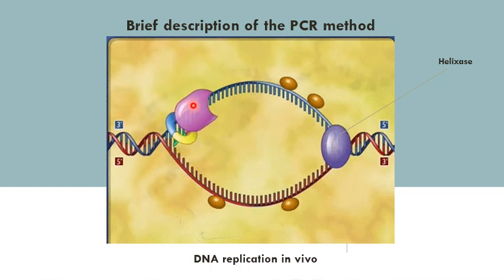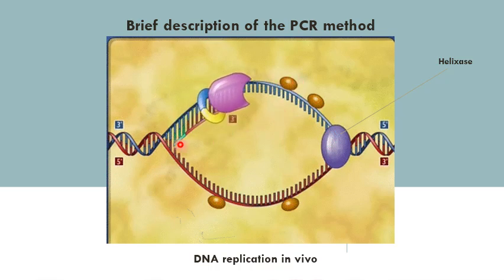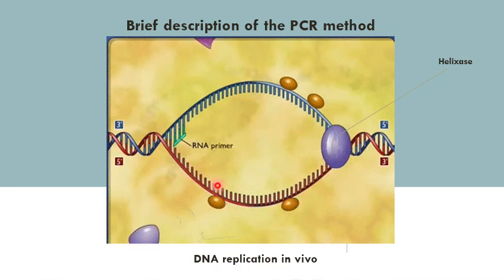So the synthesis of the newly made DNA strand will start after this primer. It's like localizing the place where the polymerase will come and react.